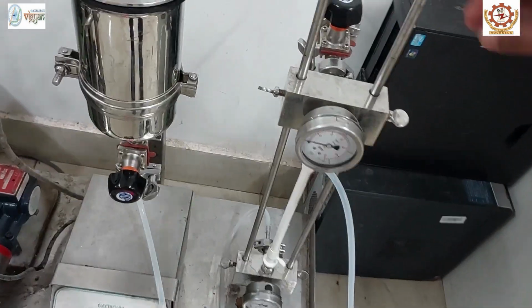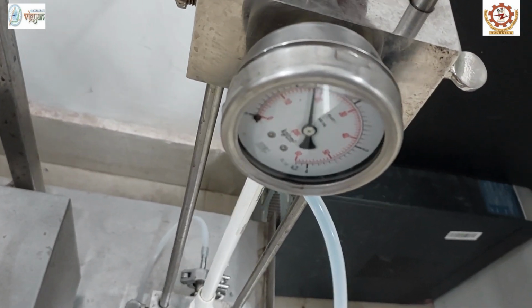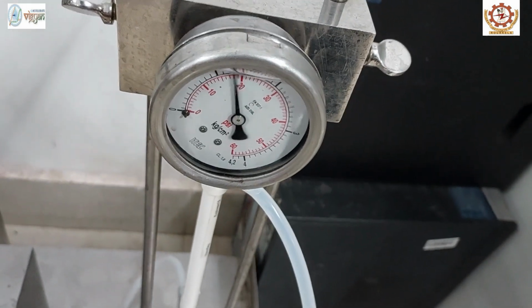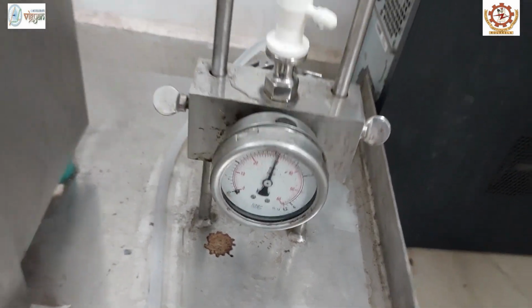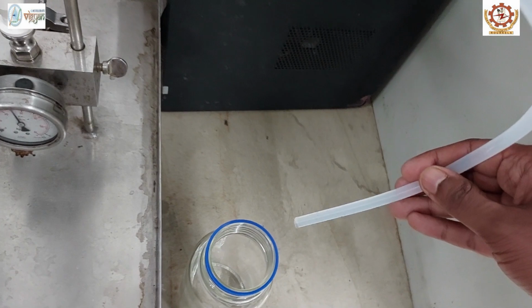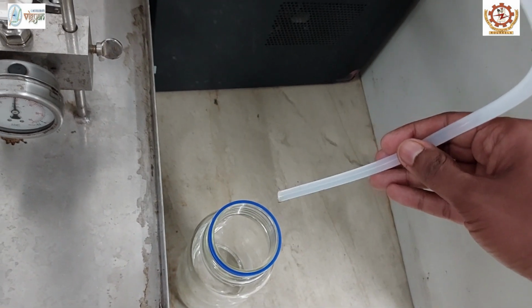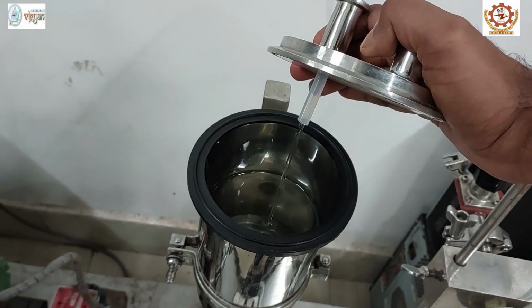However, when you increase the transmembrane pressure, see here, I have increased the transmembrane pressure to 20 psi. Once the transmembrane pressure reaches 20 psi, the filtration starts. You can see permeate collecting here, and the retentate is sent back to the feed.